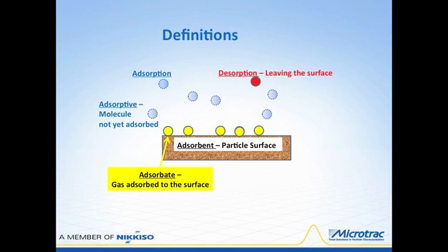But as we go through the adsorption process, we see that molecules can contact the surface, and they will become attached to the particle surface, and once they become attached to the particle surface, we will call that the adsorbate. And again, this is the gas that's actually adsorbed to the surface.